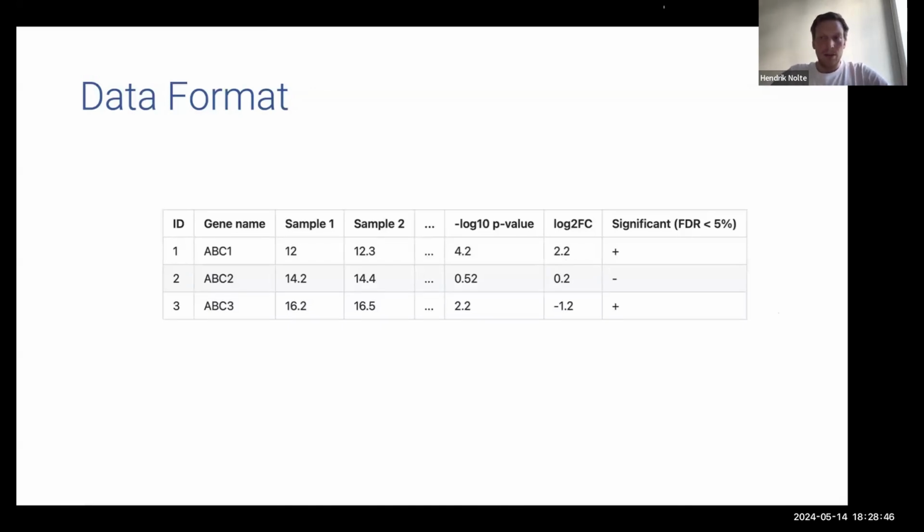Probably some of you have learned that the p-value has to be below 0.05. However, if we are dealing with very high dimensional data, meaning we have thousands of proteins, and we repeat this t-test, then we run into a problem which is called the multiple testing problem, because we simply repeat this test and then 5% will be significant even if we invent random data.